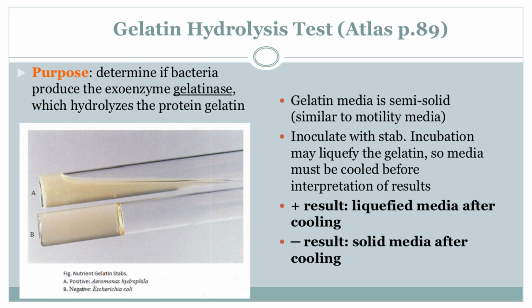But there's even more to it than that. Remember how we were talking about how gelatin comes from collagen? Yeah, that strong, flexible stuff that holds our bodies together. Right. And because some bacteria can break down a protein that's as tough as collagen, that actually tells us some pretty interesting things about how infections spread inside the body, too. Wait, so those bacteria that eat gelatin, they could be using their superpowers to cause trouble in our bodies, too. Kinda, yeah. It's not that every bacteria that produces gelatinase is harmful, but some of them can use this enzyme to help them out when they're causing an infection.